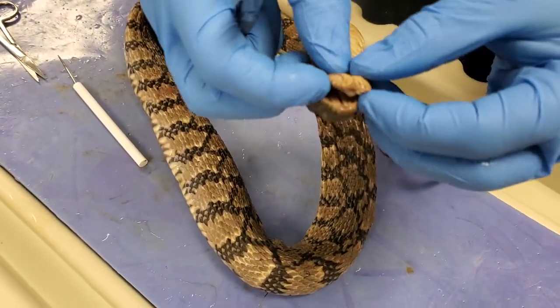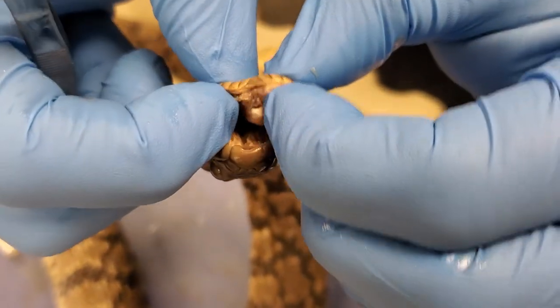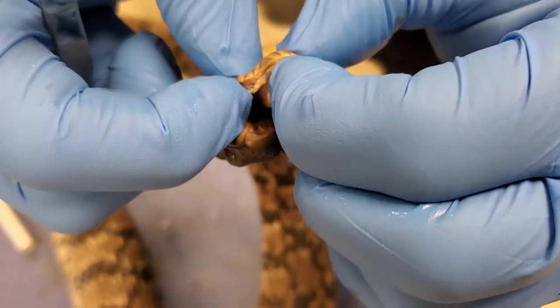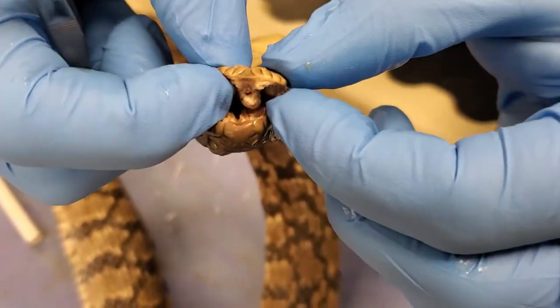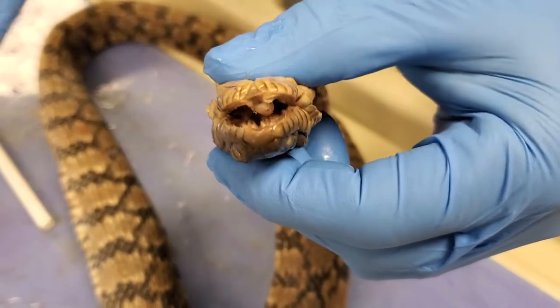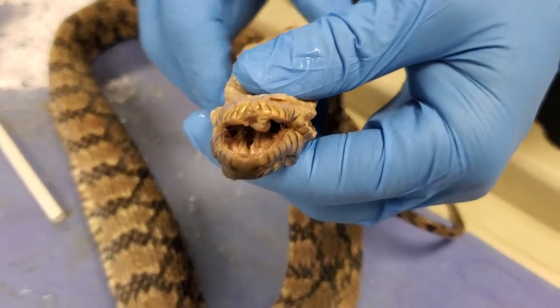Next, I'll go ahead and show you this too. The bottom jaw of the snake is actually in two different bones. See how I'm doing that? I can get wider, more narrow, wide, go up and down. We as mammals only have a single bone in the lower jaw. This one though allows it to widen out and open large to swallow large prey, because of course snakes don't take bites out of their food — they swallow it whole.